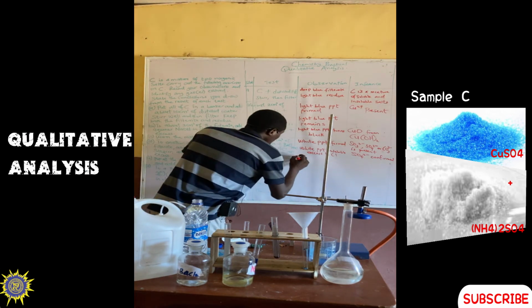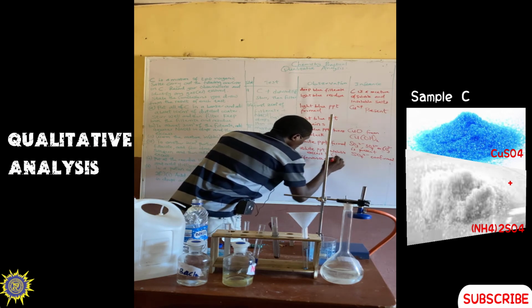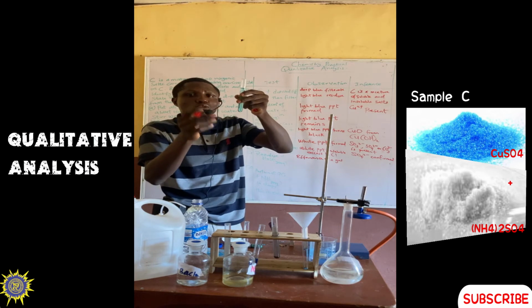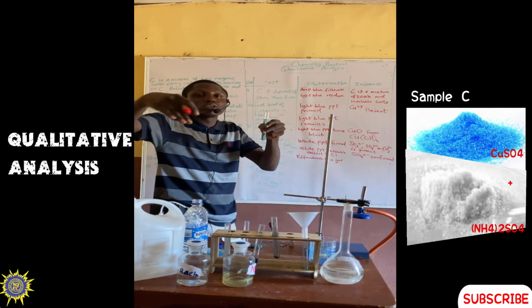We have evolution of a gas. Now if you test that gas with blue litmus paper, it turns blue litmus paper red and turns lime water milky.